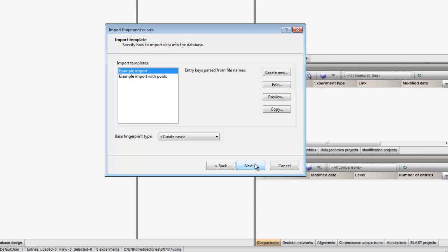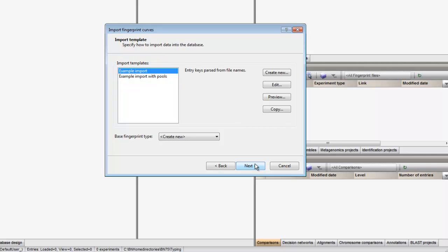In the next dialog, we find two default import templates listed. The first one will parse entry keys from the file name and the second one will parse entry keys as well as pools from the file name.